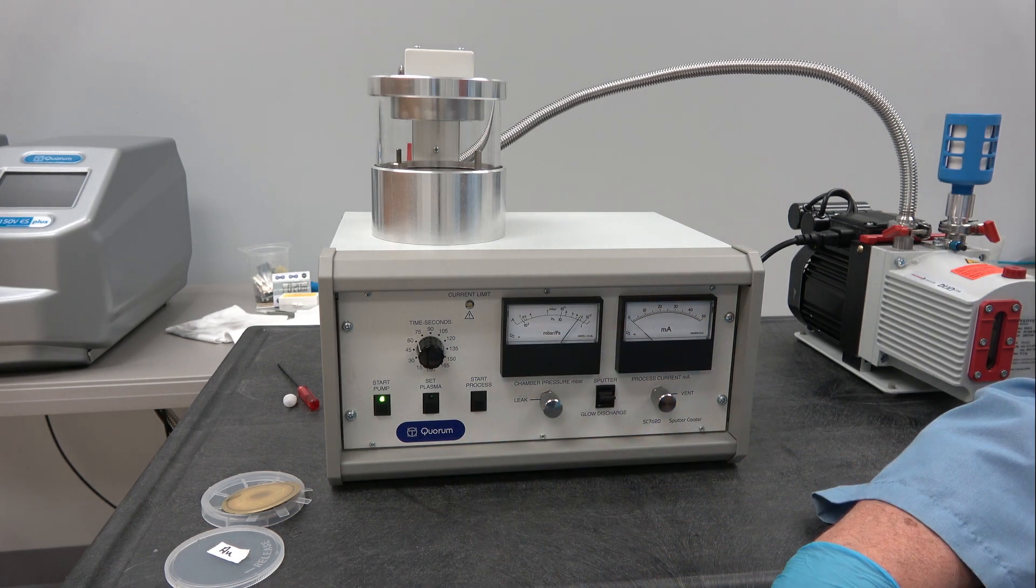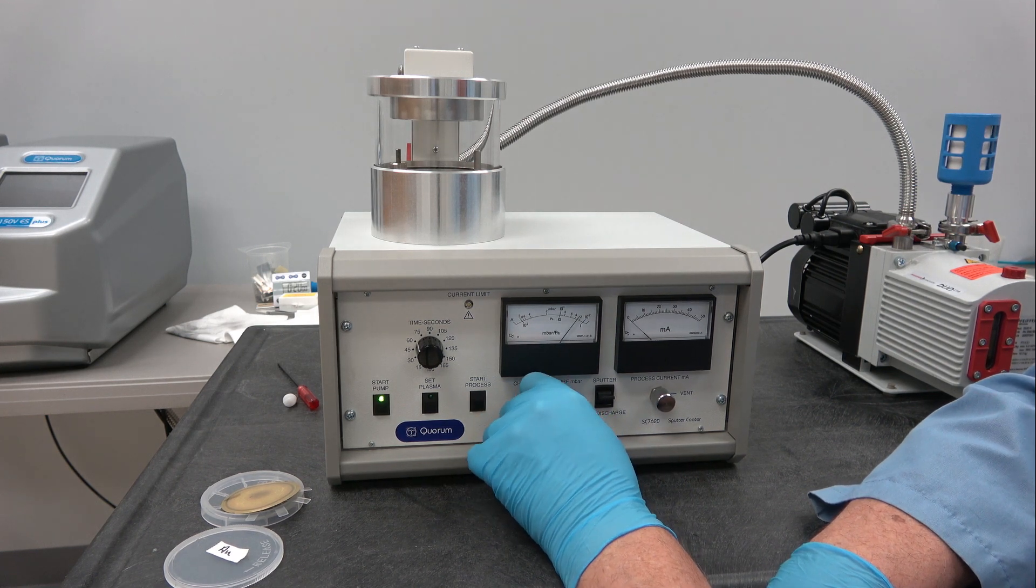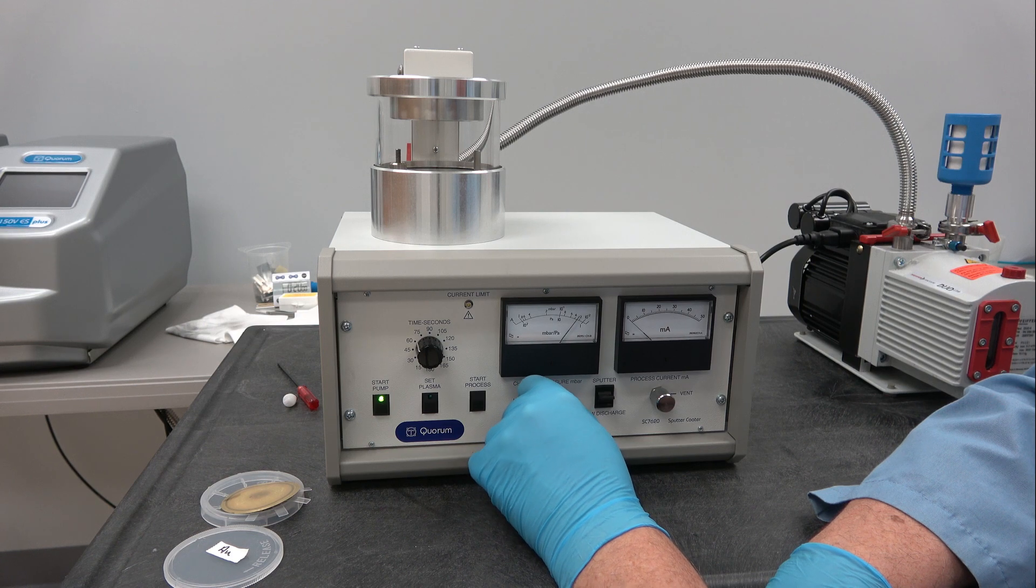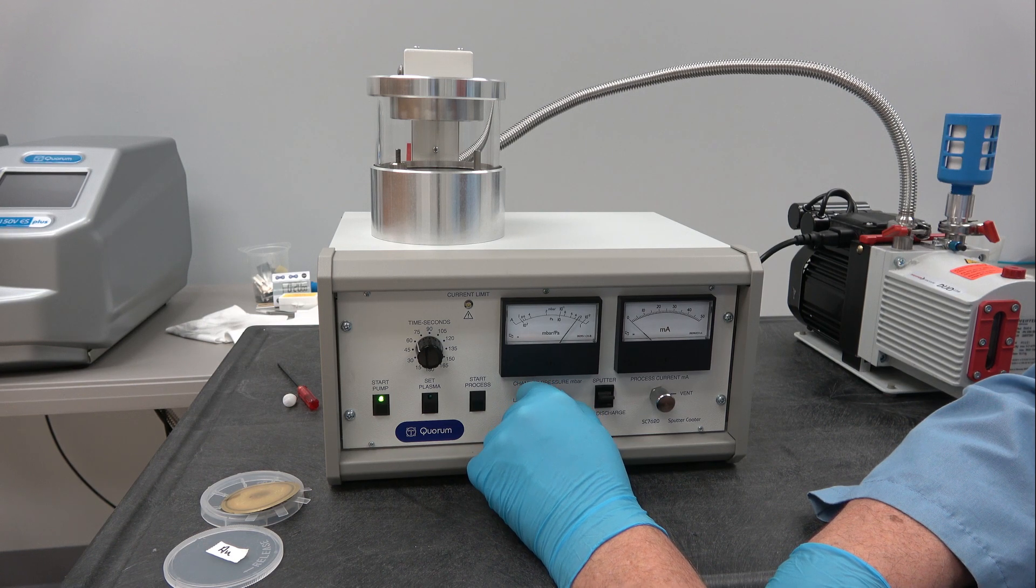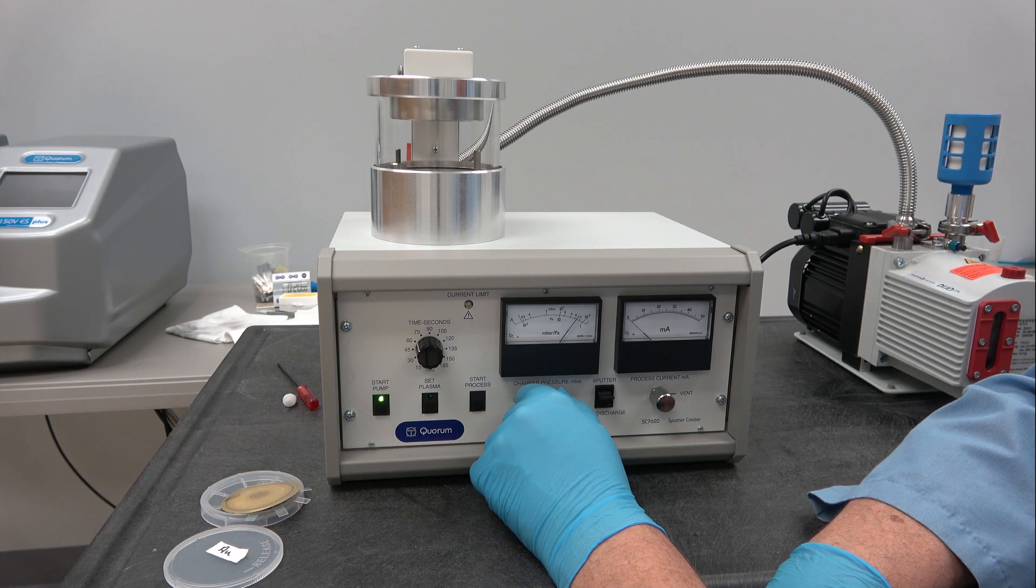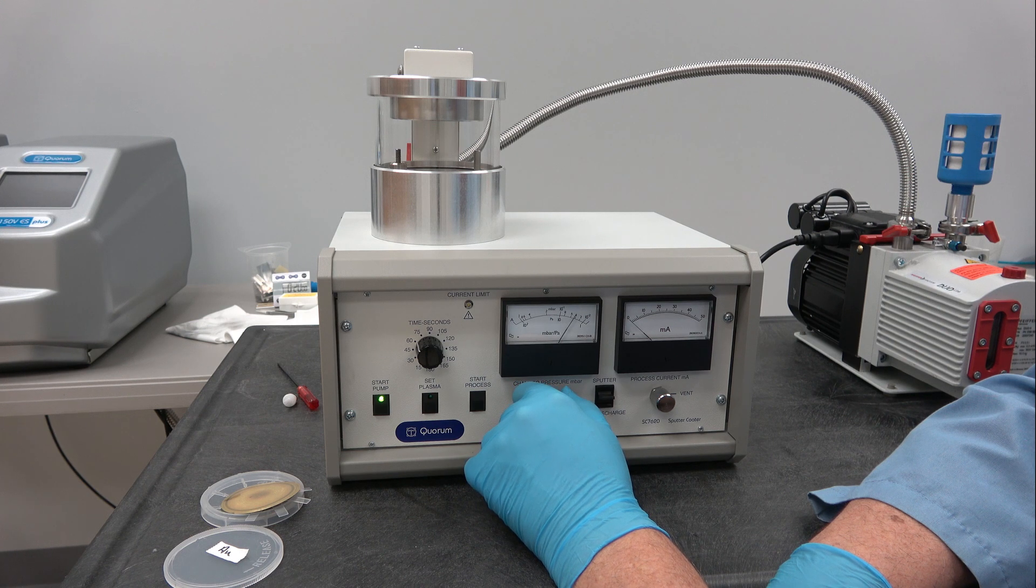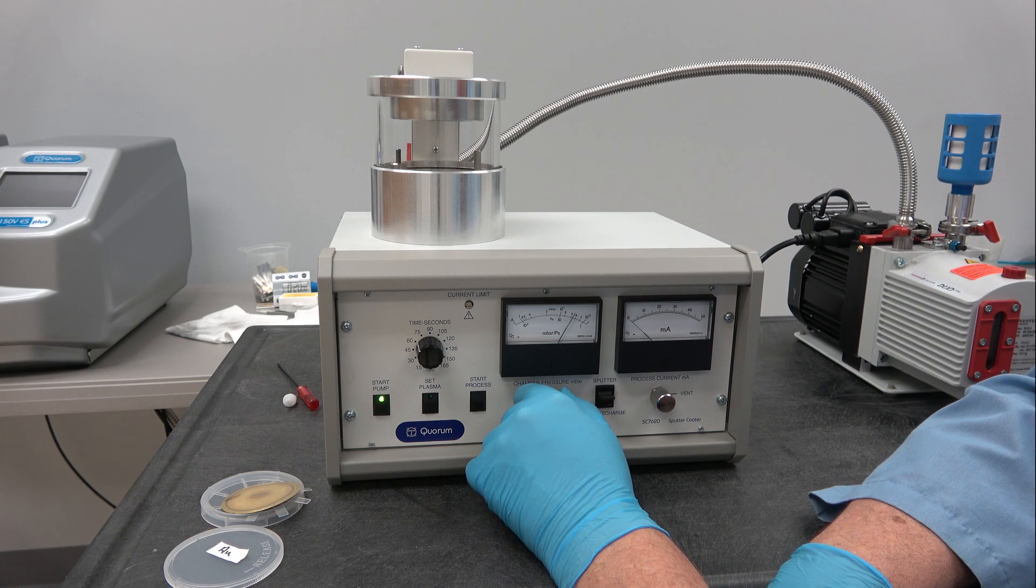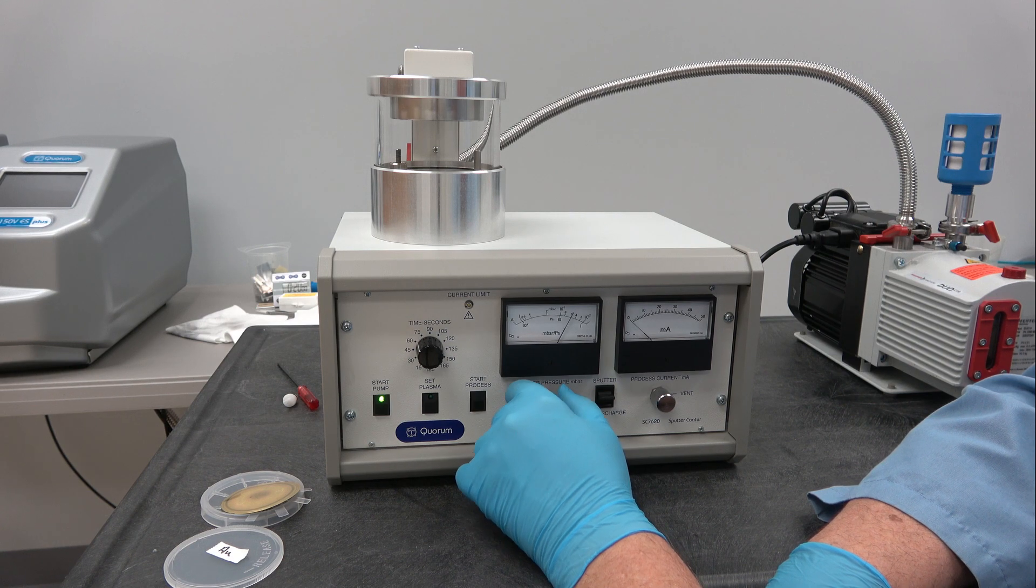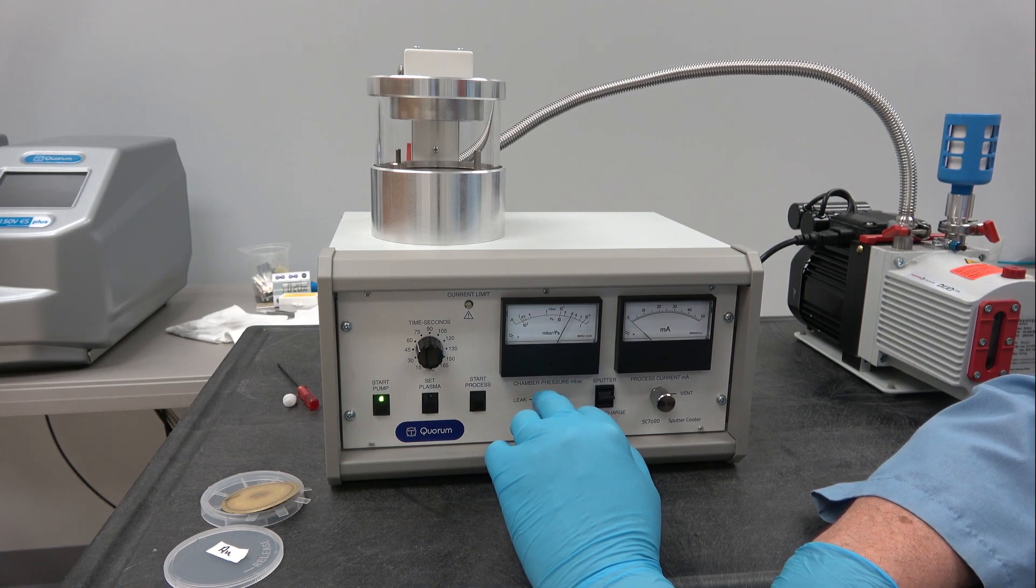So in order to get the system to sputter, you need to increase the argon gas pressure in the chamber a little bit. And we'll set it around 0.6 or 0.7. It will take a little bit of time to get used to that.